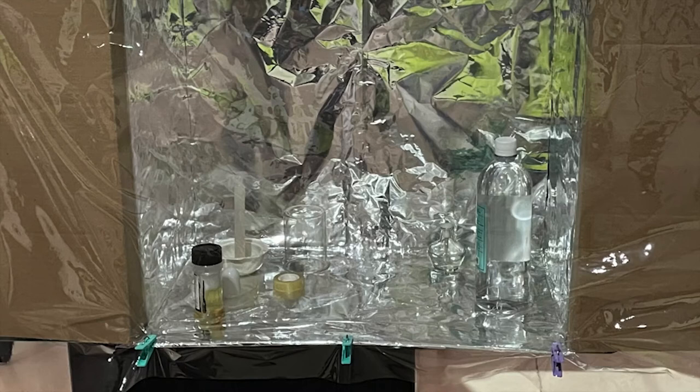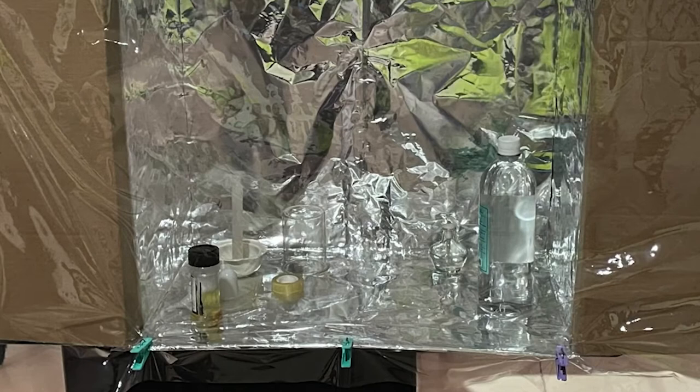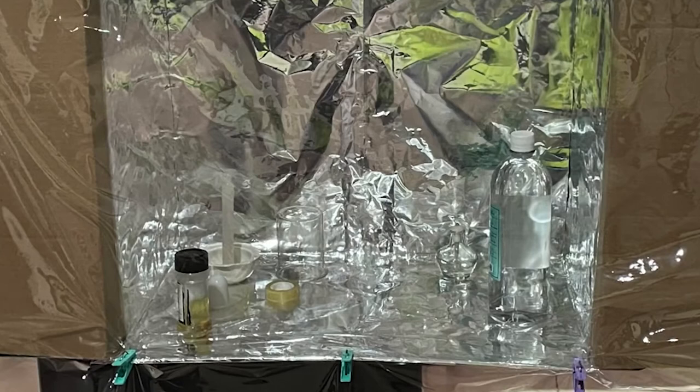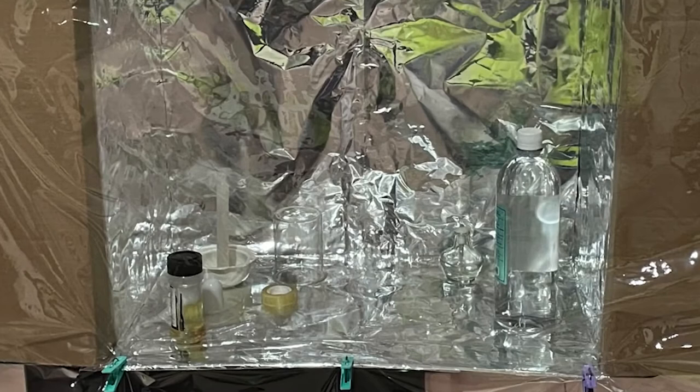Previously, a cardboard box was lined with aluminum foil and transparent plastic with holes where the gloves could enter and be able to maneuver inside. The box must be sterilized inside, as well as everything that is put in after this, using 70% ethanol.